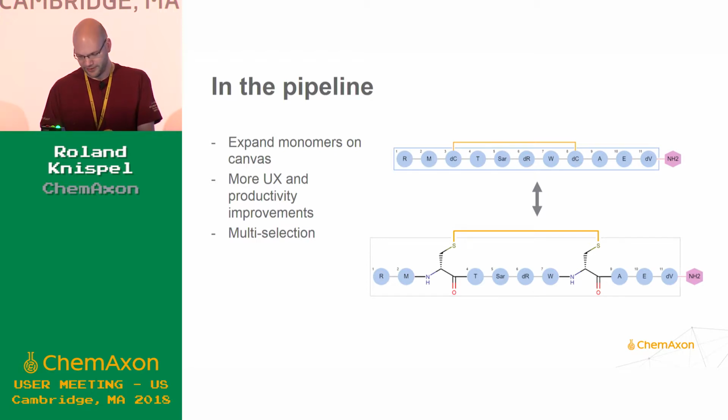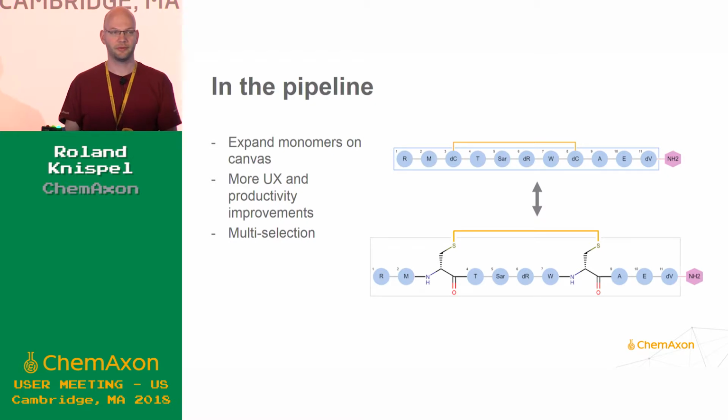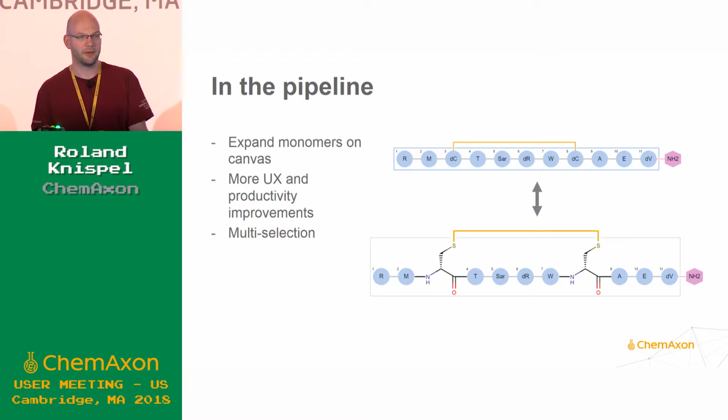One of the key things that's part of the next half year's plan is the ability to selectively say what are the parts of my structure that I'm interested in on a chemical detail level, and what are the things that are so standard that I don't really care about. The ability to expand individual things and yet have a clean representation of my molecule, that's something that will happen within the next couple of weeks, actually.